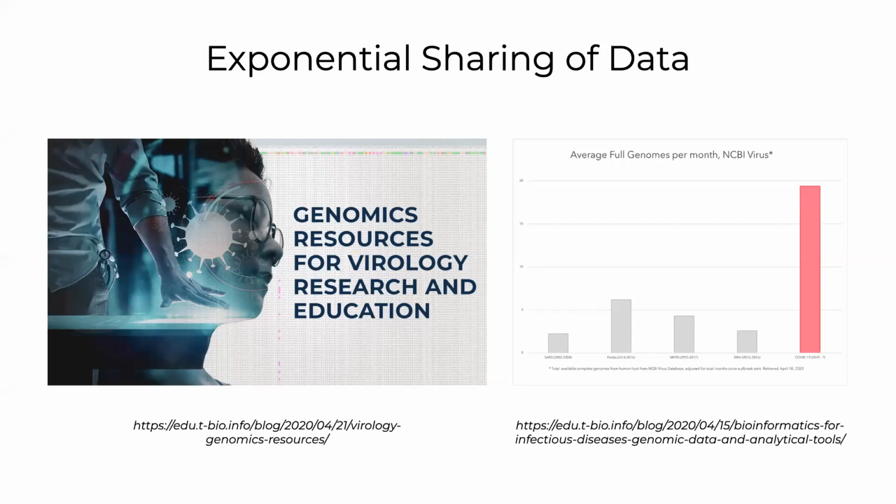And what we discovered is that at least 4 times as many genomes, specifically in this outbreak, have been sequenced and made available as soon as those data sets were collected. And so I think it really shows us how accelerated the process of sequencing has become. The technologies have become much more accessible and affordable.